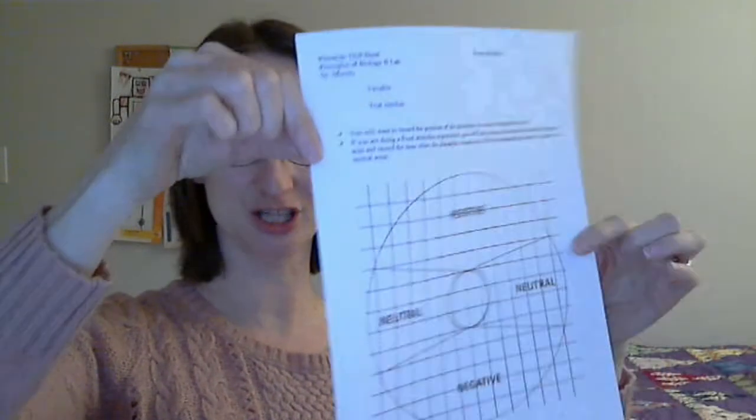So, experimental design. You can deviate from this a little bit, but I want to give you a basis to start with, so you're not starting completely from scratch with no clue what to do. In your lab there is going to be a whole big pile of these Planaria grid sheets. In the picture there, I have two of them, and I did that for a purpose. You're going to lay them flat on your bench. On one of them, you're going to have a big petri dish and you're going to put solution in it. Then in that circle right in the middle, you're going to drop your worm, and then you're going to watch the worm move around the dish.